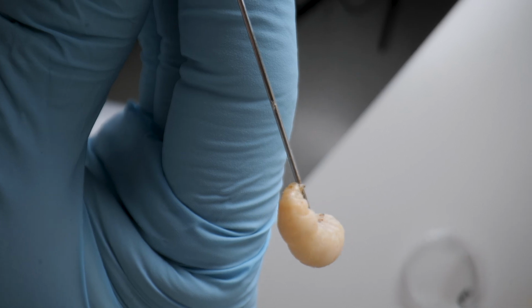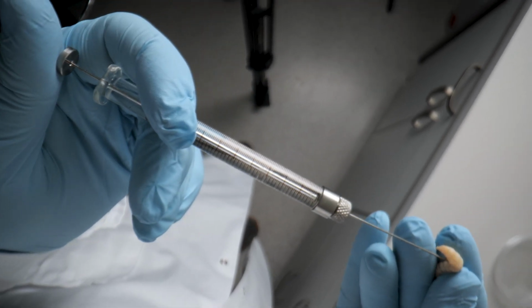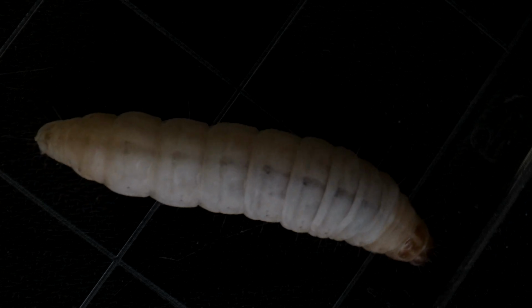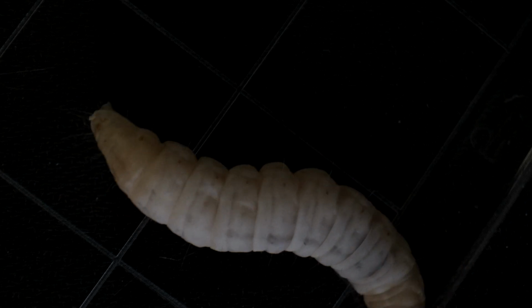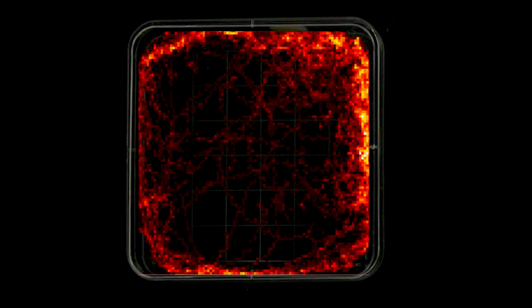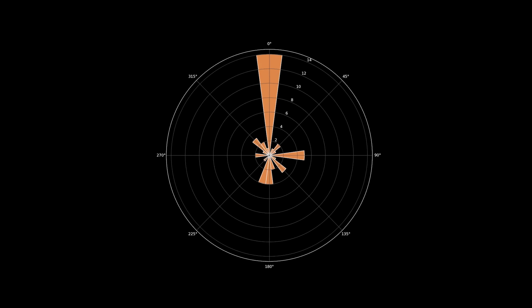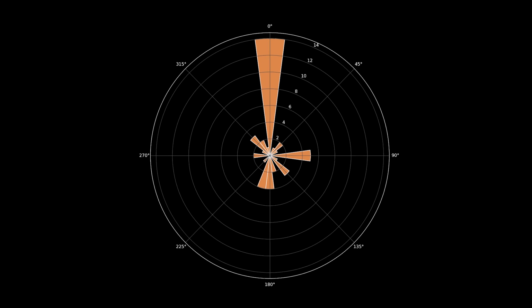The most exciting moment, however, came when the scientists exposed the larvae to alcohol and energy drinks. As could be predicted, alcohol slowed the larvae and disoriented them. Interestingly, in some cases, it even changed their behavior, making some of them crawl toward the light, something unseen in normal, healthy larvae. The path pattern changed, something that, again, can be elegantly depicted and quantified in the rose diagram.